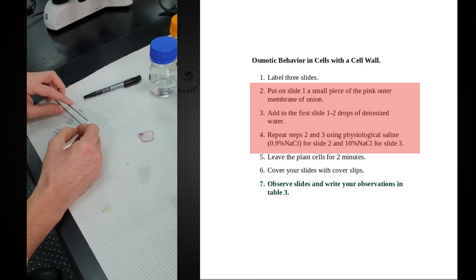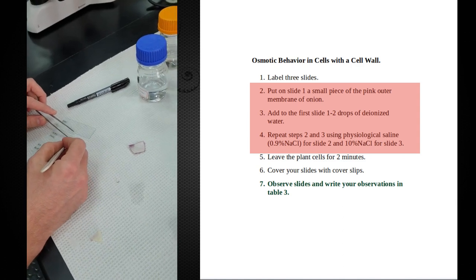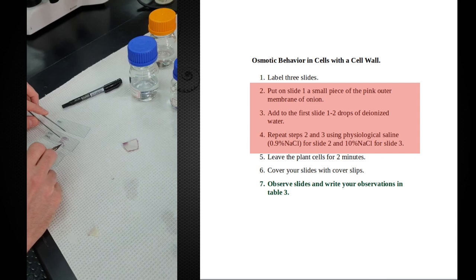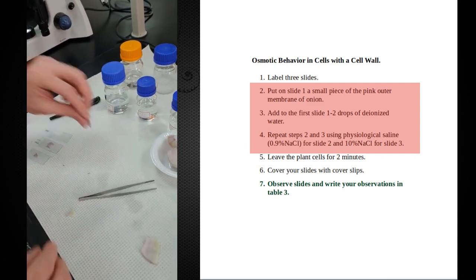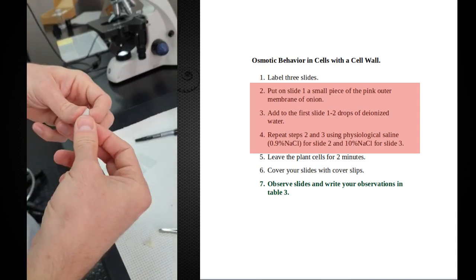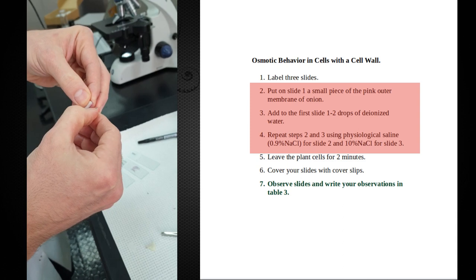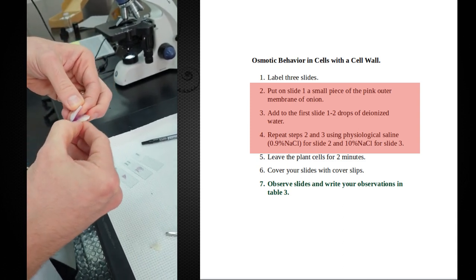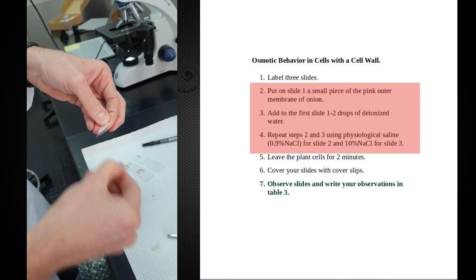Try to flatten these out a little bit, just so that we can see nice single layers of cells. If you have cells folded over each other, it's going to be more difficult to see details that we're interested in. Okay, and one more. I can still use this piece here. Break and pull, and right here on the bottom is where I see a lot of these red cells. I'm going to try to pull this one off.